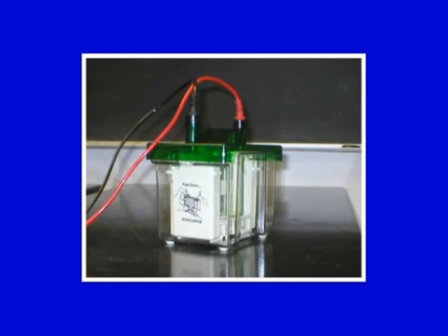The gel apparatus is kept in here, and as you switch on the electric current, protein migration and separation will take place. After the protein has been run, you can remove the gel plates from here. Gel plates could be separated and the gel put in a staining solution, like Coomassie or any other dye, and the bands could be visualized.